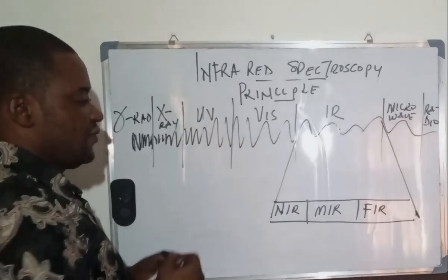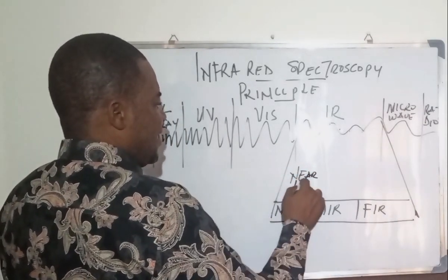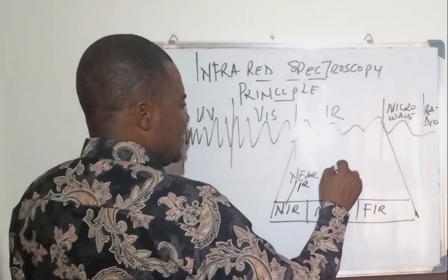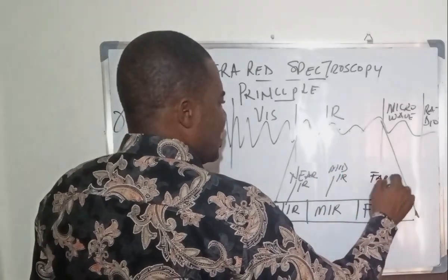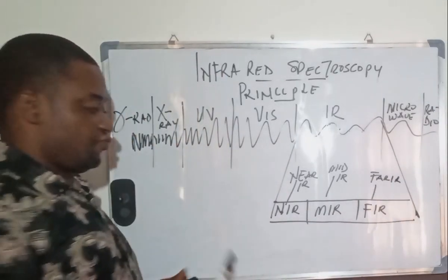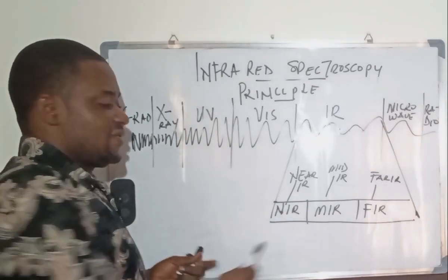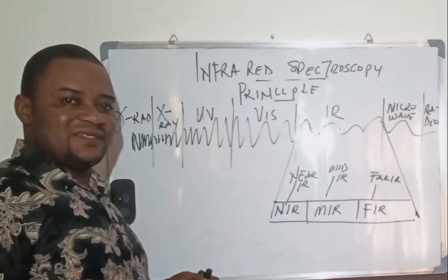So you need to take note of that. Here we have the near IR, here the mid IR, and here the far IR.